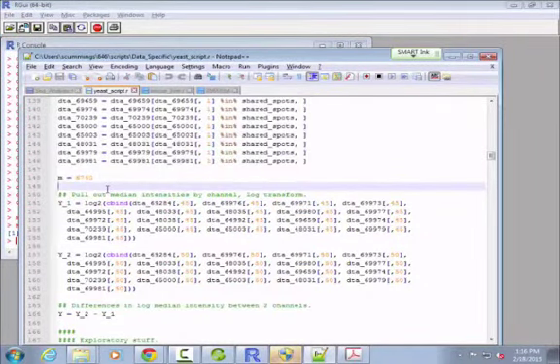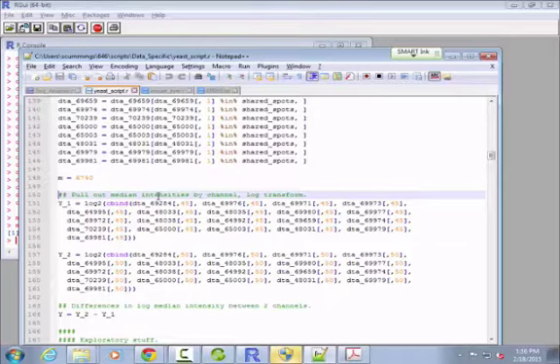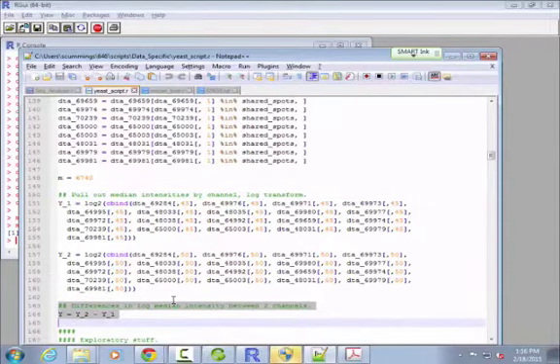The intensities are going to be median intensities. So back in that text file, we had a column for median intensities. We had a column actually for channel 1 and channel 2. And what I'm going to work with is the channel difference, actually log channel ratio. So difference in log channel intensities comparing the target channel to the control channel.